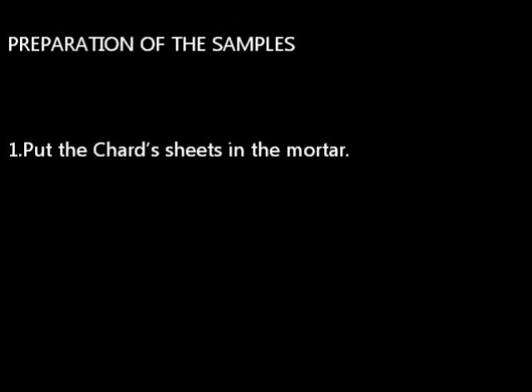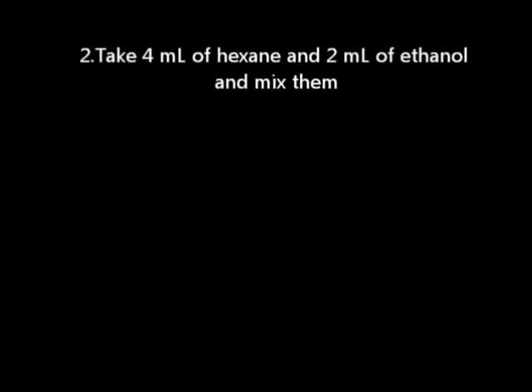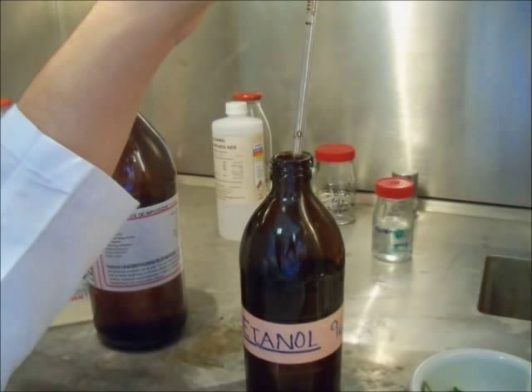First, put the chard sheets in the mortar. Take 4 ml of hexane and 2 ml of ethanol and mix them.